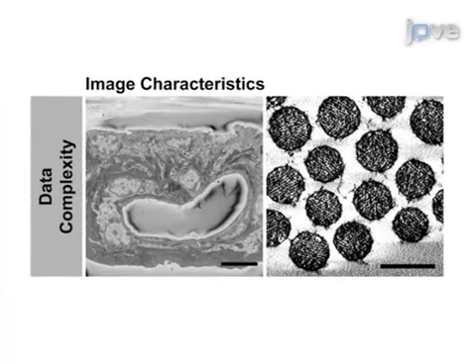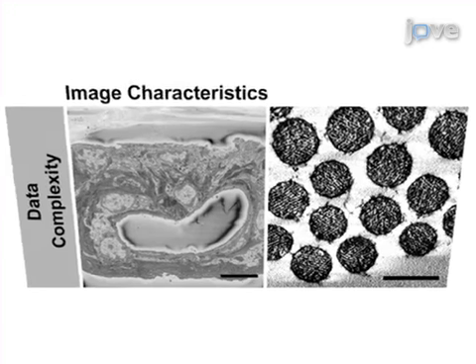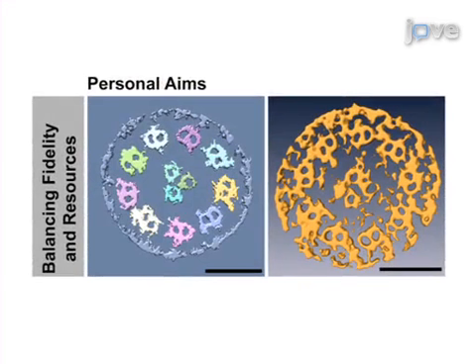The results show final 3D segmented models of features of interest based on triaging image characteristics and personal aims to choose the optimal segmentation approach. A comparison between the different approaches for the different data sets will help select the correct segmentation strategy.